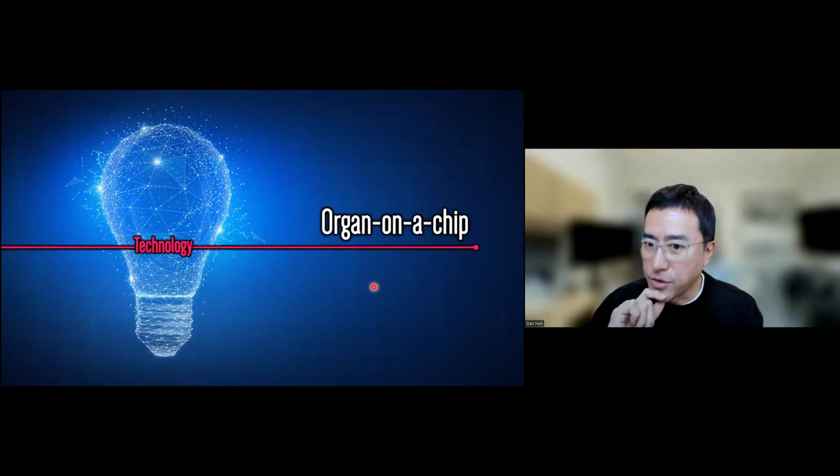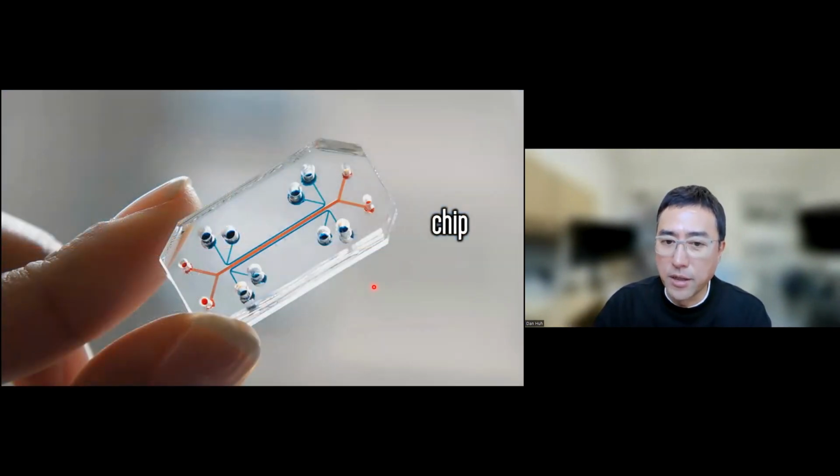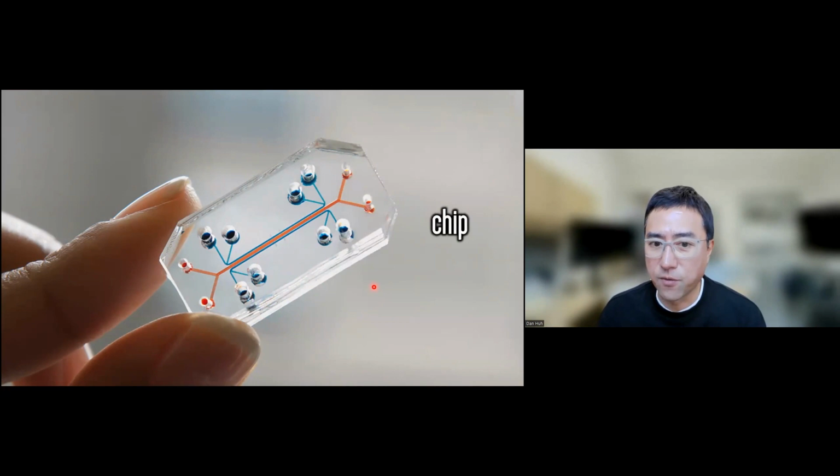So I was told by Leila and John that many of the attendees in this webinar might not be familiar with the idea of this technology, or maybe the technologies and approaches that we use. So what I'd like to do is to maybe briefly explain the gist of this technology approach, and then deep dive into maybe some of the models relevant to this HIRN consortium happening in my lab. So what we do in my lab basically revolves around this idea of using microfabricated devices for biomedical applications.